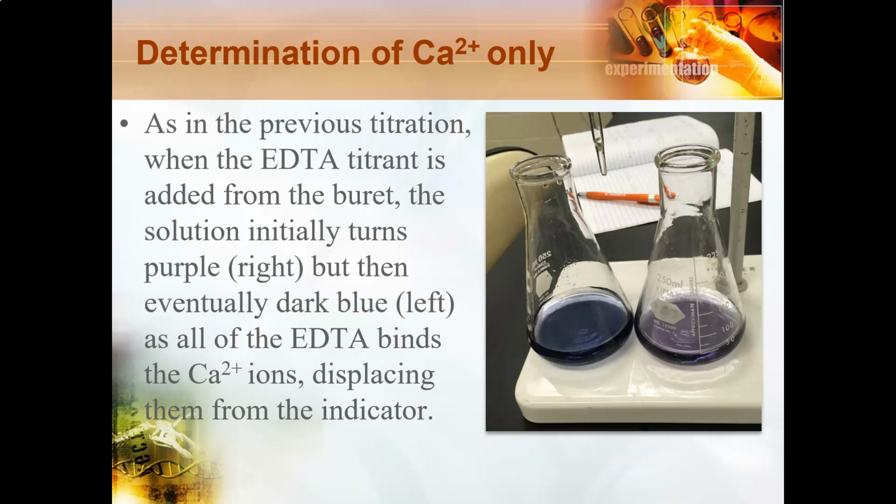So we do the titration again with EDTA, so you can just use sort of the tip of my burette here. So we add the EDTA, and the same kind of thing happens. The EDTA will displace the calcium from the indicator, and the EDTA binds to the calcium itself because the EDTA binds to the calcium more strongly than the indicator does. And you'll see it goes from that pink color I showed you on the previous slide to a purple, but then one drop just gets it right to the blue color. So as soon as you get to the blue color, you know you have all free indicator and all the calcium is bound to the EDTA. And the magnesium hasn't participated at all because we precipitated it out.